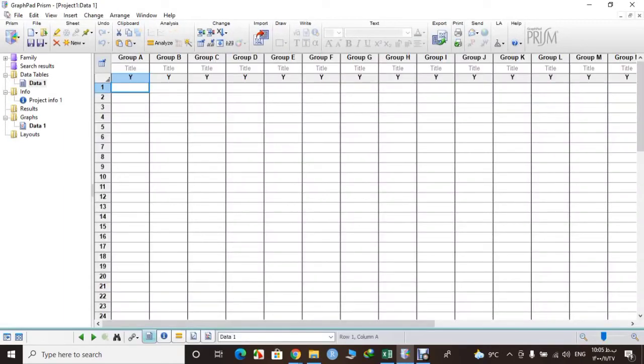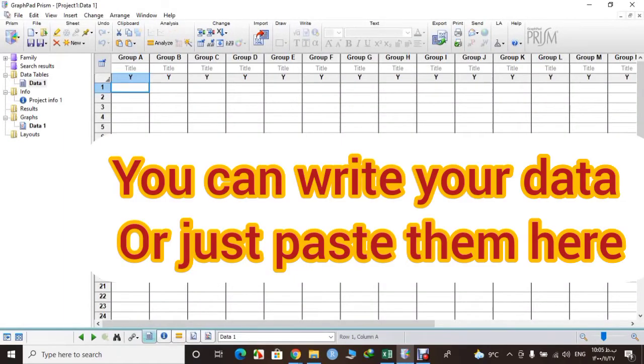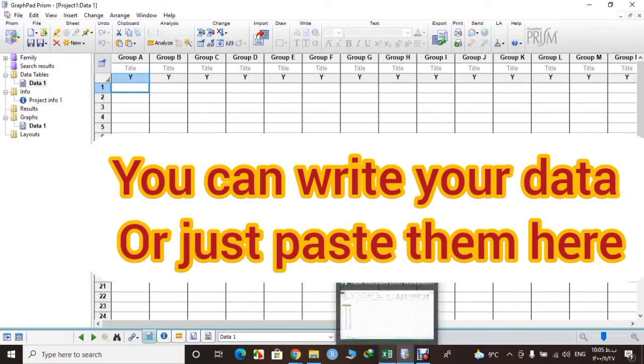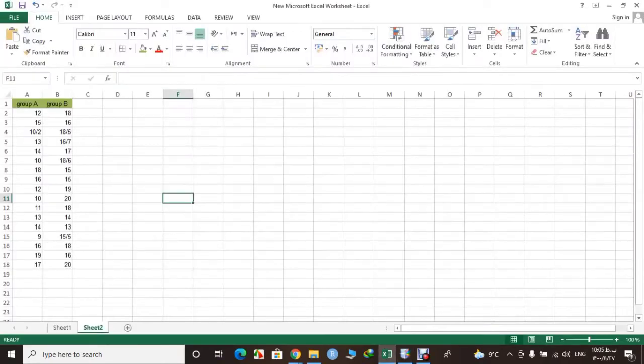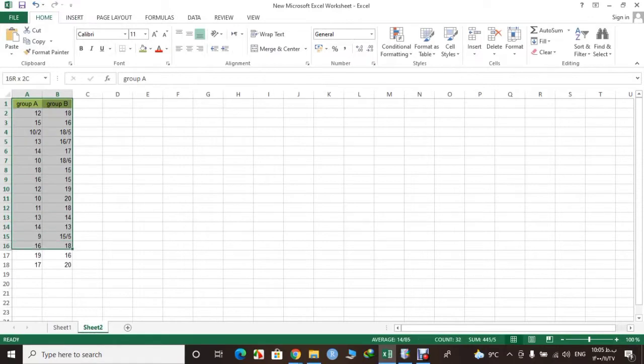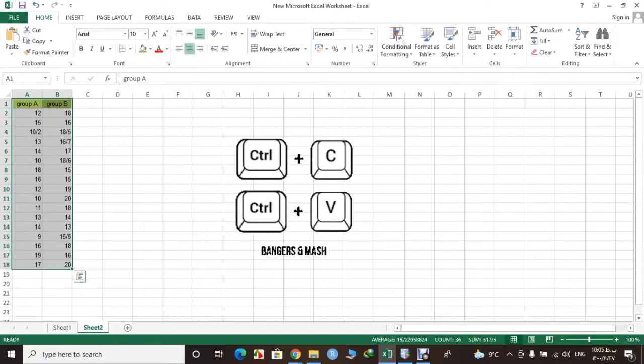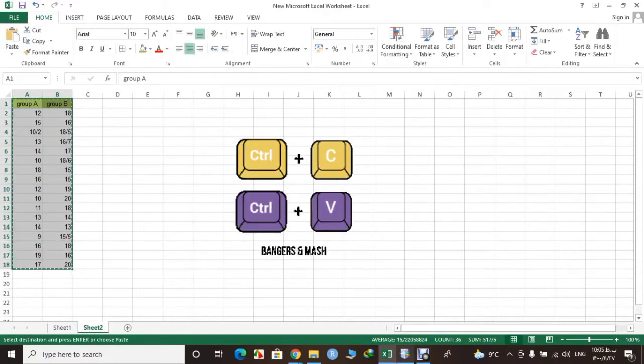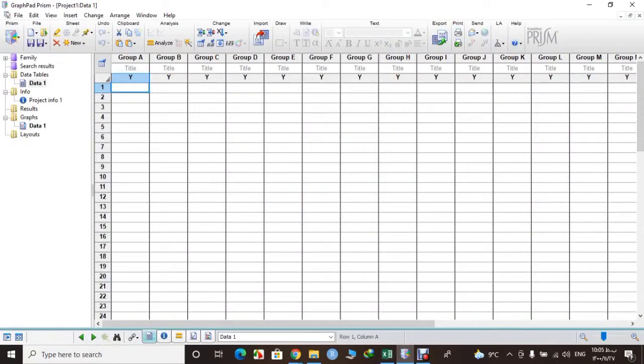In this page you need to write down your data or you can simply copy and paste them from an Excel file, whatever you like. I prefer to copy them from Excel and then simply paste them in Prism.